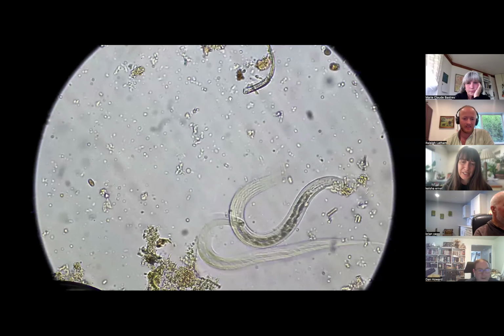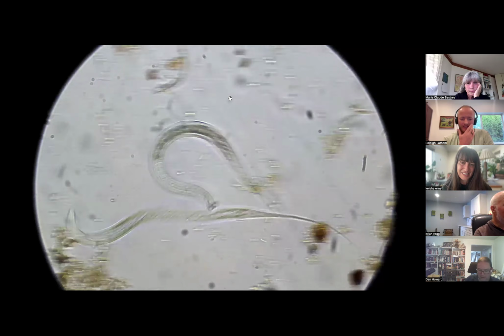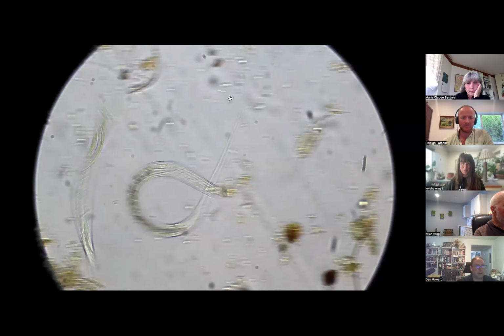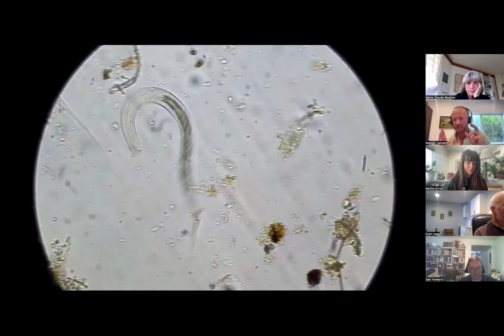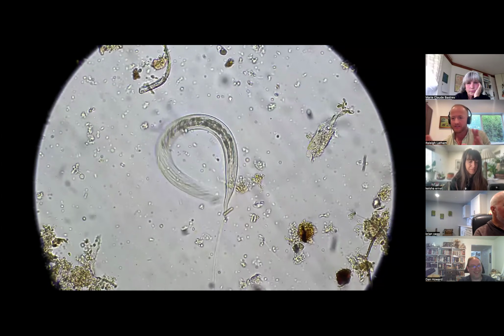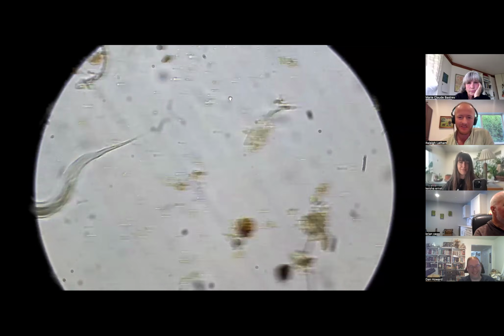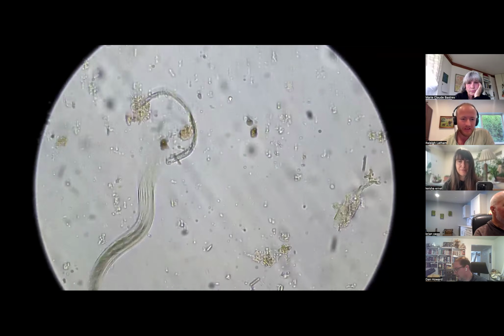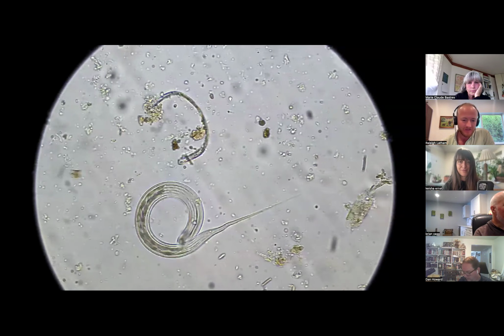Is this your soil or your compost, Brian? This is the vermicompost. Beautiful. It's so cool seeing the difference, even in this class, like the thermophilic compost samples, they seem quieter. You see the amoeba, you see the fungi. It's kind of like stability. And then this vermicompost sample, it's still this big microbial balancing act happening. And yeah, just the life you see in there is so cool.